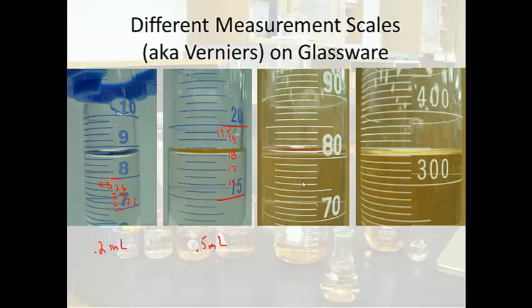Over here on this graduated cylinder we go from 70 being here and 80 here. 1, 2, 3, 4, 5, 6, 7, 8, 9. Hey, this is easy. This is graduated in one milliliter increments. So this would be 71, 72, I'm going to skip, 75, 76, 77, 78, 79, and finally there's 80.